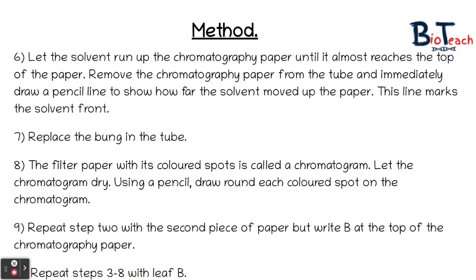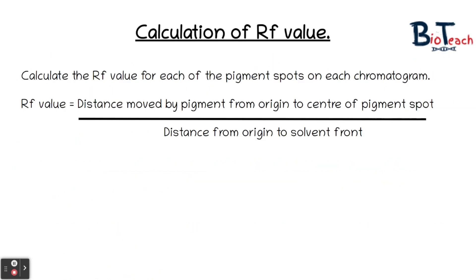The chromatography paper with its coloured spots is now called a chromatogram. Let this chromatogram dry and use a pencil to draw around each of the coloured spots that you see on the chromatogram. Repeat all of the steps that we've talked about with the second leaf creating another chromatogram with leaf B, and by the end of it you should have two chromatograms that you can compare to each other.